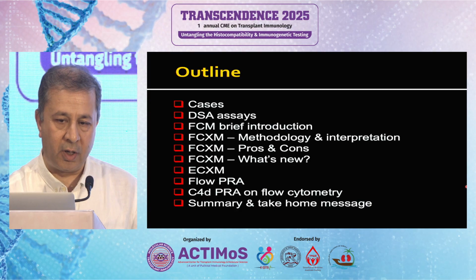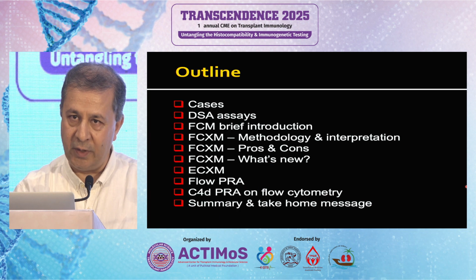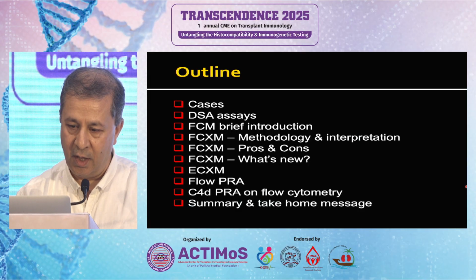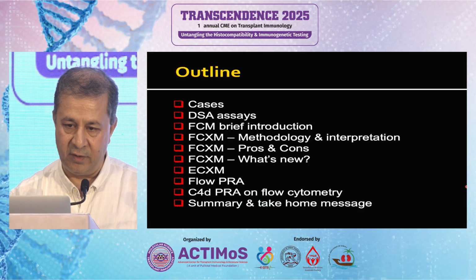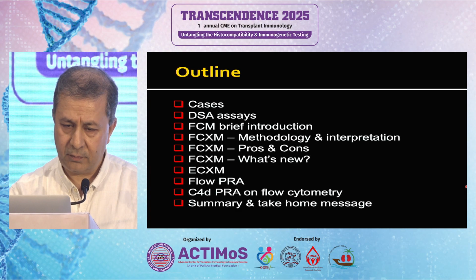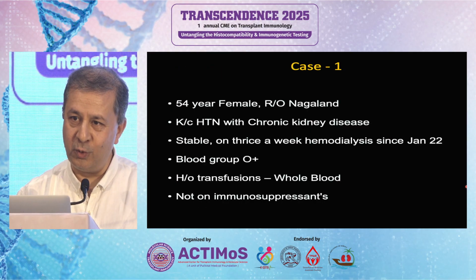I have outlined my talk, giving you a few cases to start with. We'll talk about DSA, and since a lot of it has already been discussed, I will not really delve into details of that. We'll talk about flow cytometry, a brief introduction, methodology, pros and cons, and what is new in flow cytometry if time permits us.